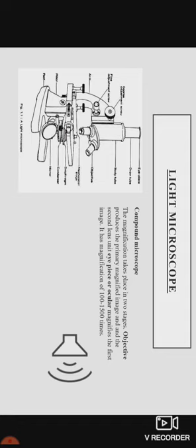The first lens unit, called objective, produces a primary magnified image, and the second lens unit, that is called the eyepiece or ocular, magnifies the first image. Such microscopes employing two lens units in working position at one time are called monocular mono-objective microscope.